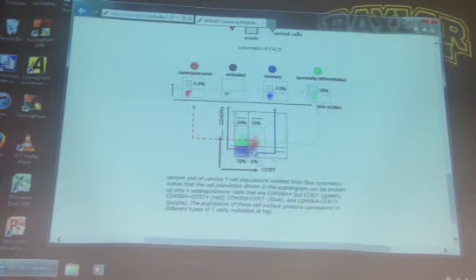And then you can divide up the scatter plot depending on your own thresholds. And here we seem to have 4 populations, though it actually looks like one big blob. But normally you'll actually have 4 blobs or 2 blobs or whatever you're looking at. And let's say this were really 4 blobs. We'll color this population green. We'll color that population red. We'll color that population some other color. And then this population purple, and then we'll color this population blue.